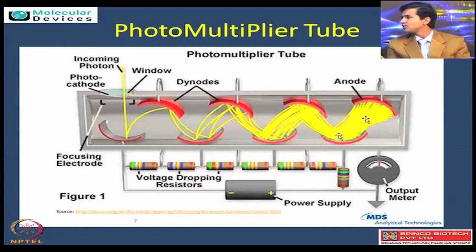Yeah, so just I will interrupt you here. When people scan these microarray slides, it always asks for the PMT gain, right? So I think that's what you're talking about here, the photomultiplier tube and the PMT gain. Yes. So maybe you can clarify how one can adjust that parameter of PMT gain. So the basic thumb rule is, in any scanning, you don't want to see a white spot.